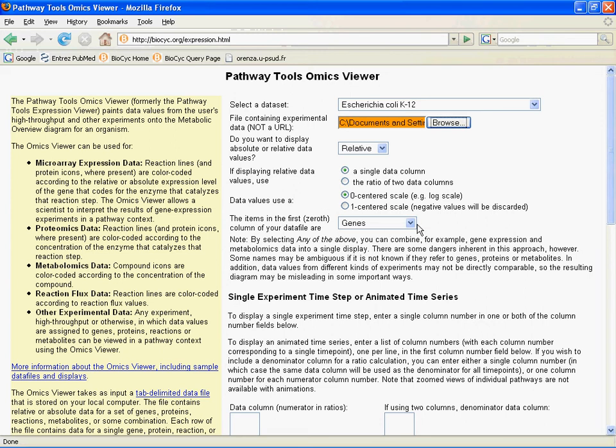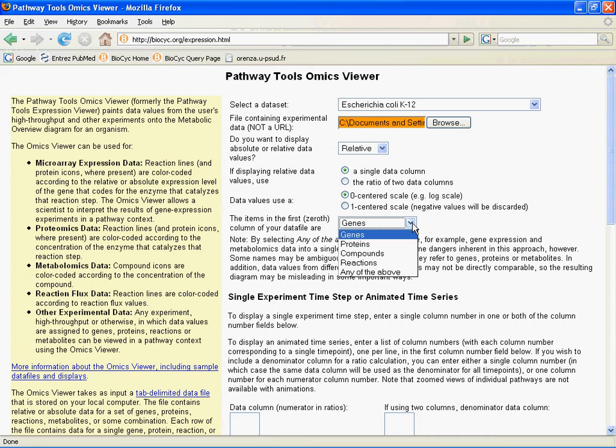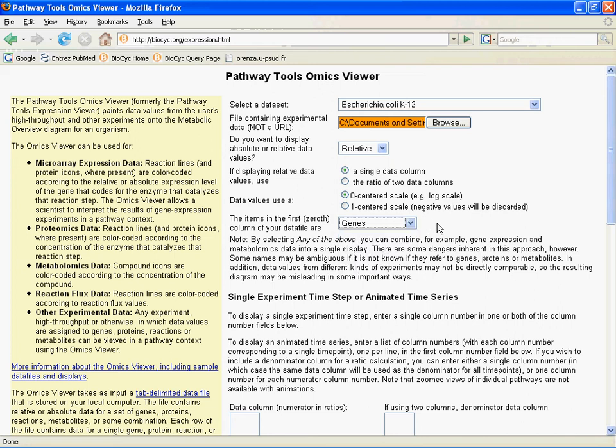Then, the items in the first column of your data file — you click this drop-down menu and you're able to select genes, proteins, compounds, reactions, or any of the above. The 'any of the above' option is interesting because you might want to show both gene and protein fold change levels at the same time. Keep in mind that not all cellular components change over the same fold range, so it may not be meaningful to show genes and reaction fluxes or genes and compounds together. We'll stick with genes for now.